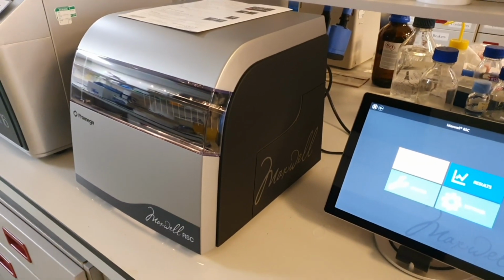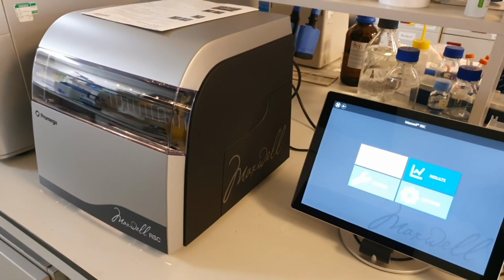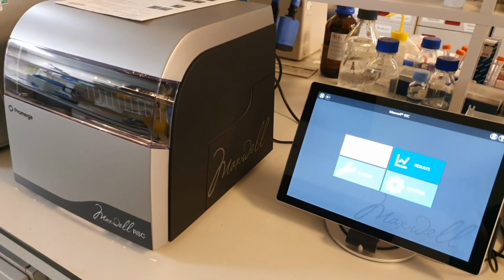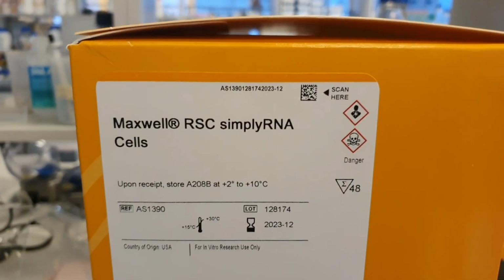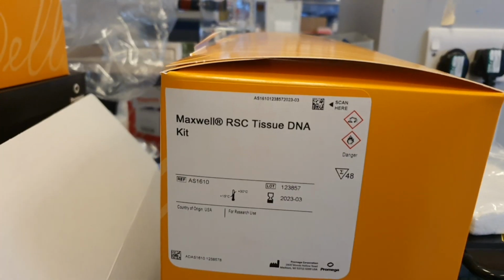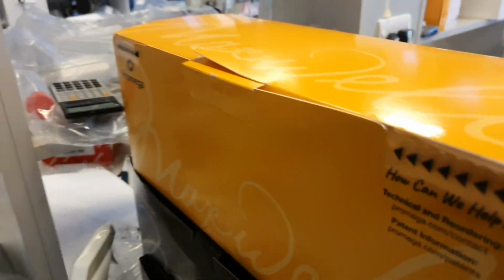You can use it to extract RNA from cells or from tissue. Today I'm going to extract RNA from cells. For that you will need the kit for the cells, called Maxwell RSC Simply RNA Cells. If you're doing it from tissue, then you will need this kit. So let's see what's inside the kit.